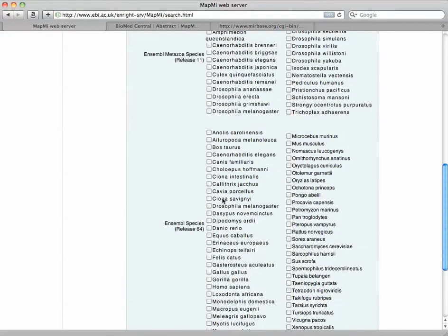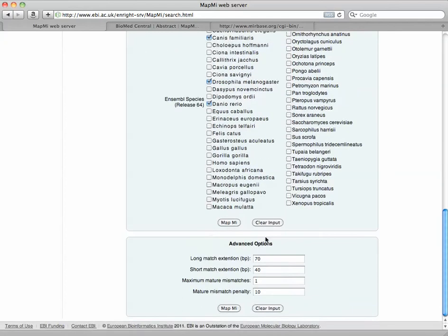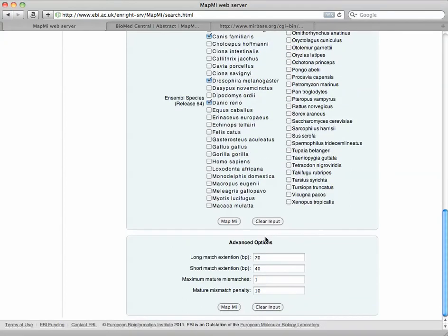Then you choose your species. I'm going to scroll down and choose cow, dog, and let's just choose a couple others just for fun. You can change some of the parameters here. We're just going to leave that and click Map Me.